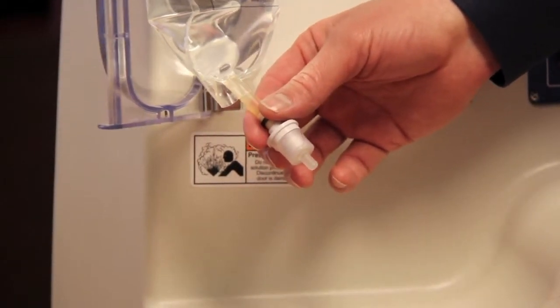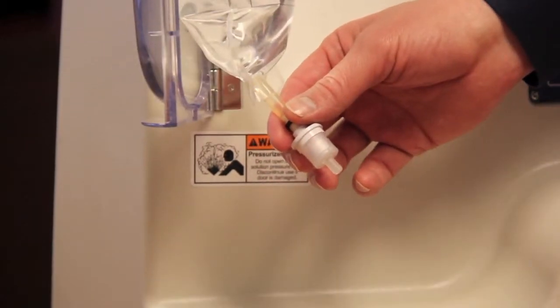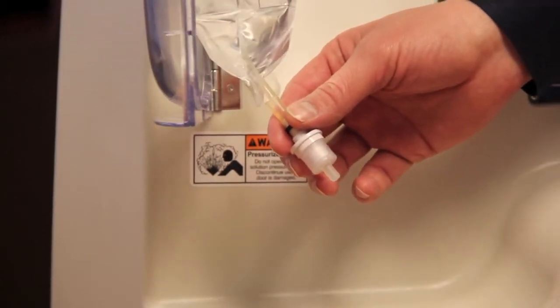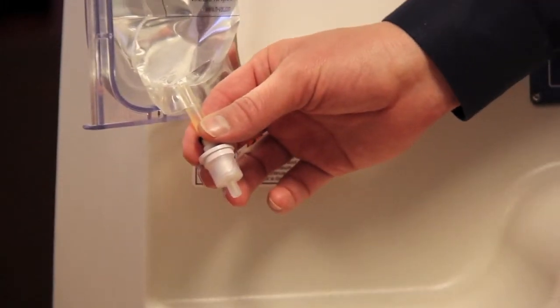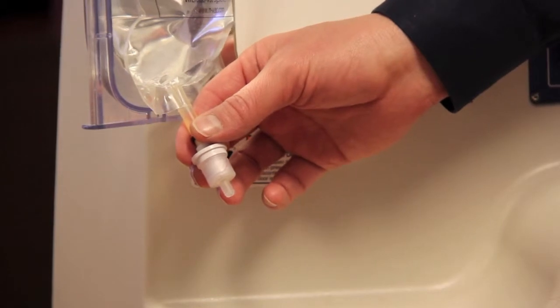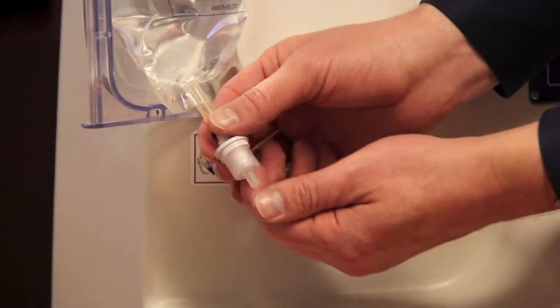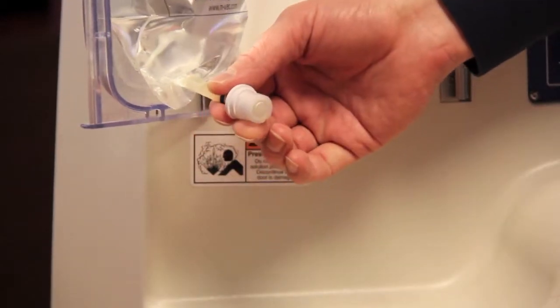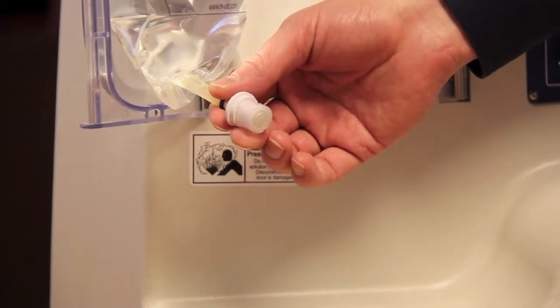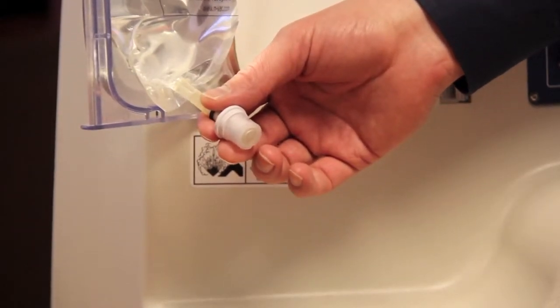Before the extension tubing can be connected to the solution bag, this small protective cap needs to be removed, which exposes the septum underneath. These instructions are also directly on the bag in case you need to review. You simply push the cap to the side, which exposes the septum at the bottom — that is where the end of the extension tubing will insert.